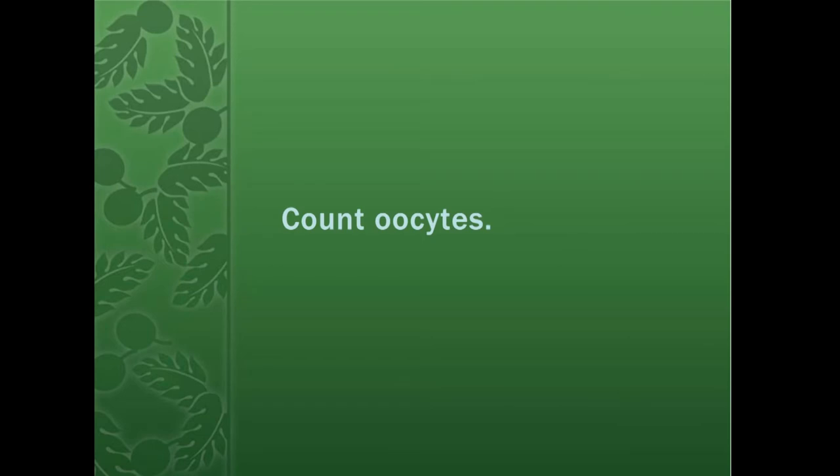And for each of those specimens, you'll count the number of the largest oocytes in the samples. Here's a short video to show you how to do that.